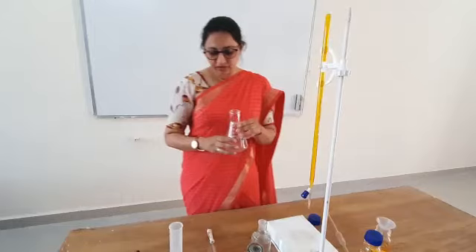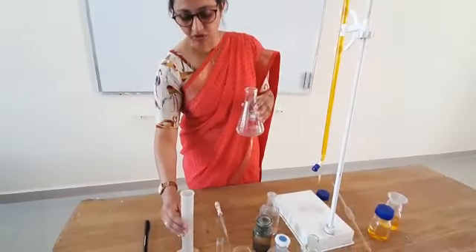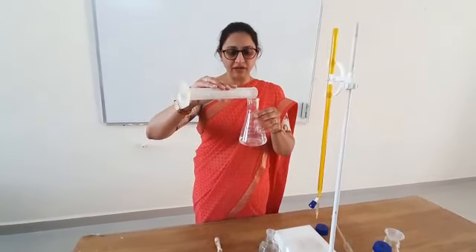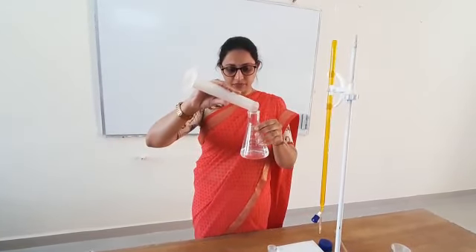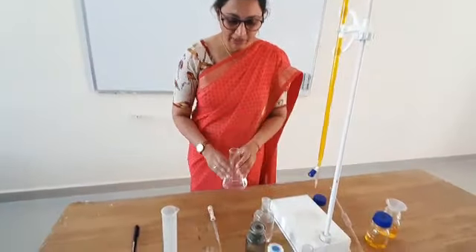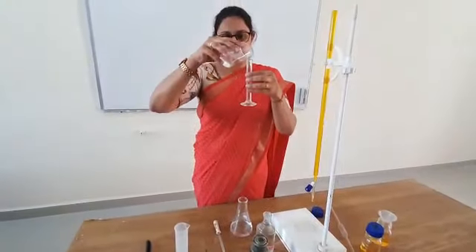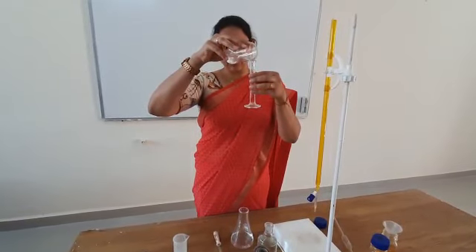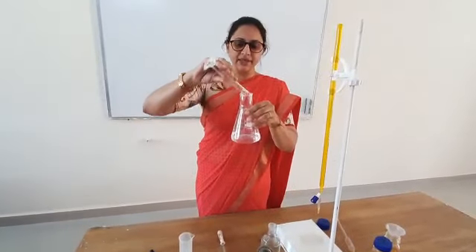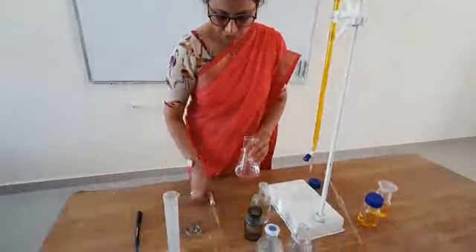Since we need to use the internal indicator, I will add it shortly. But first, I will add 50 ml of normal tap water to avoid a premature reading — in this practical the endpoint color appears very early, so we dilute the solution. Next, 5 ml of H2SO4 acid is added to acidify the solution, followed by 2 to 3 drops of diphenylamine indicator.